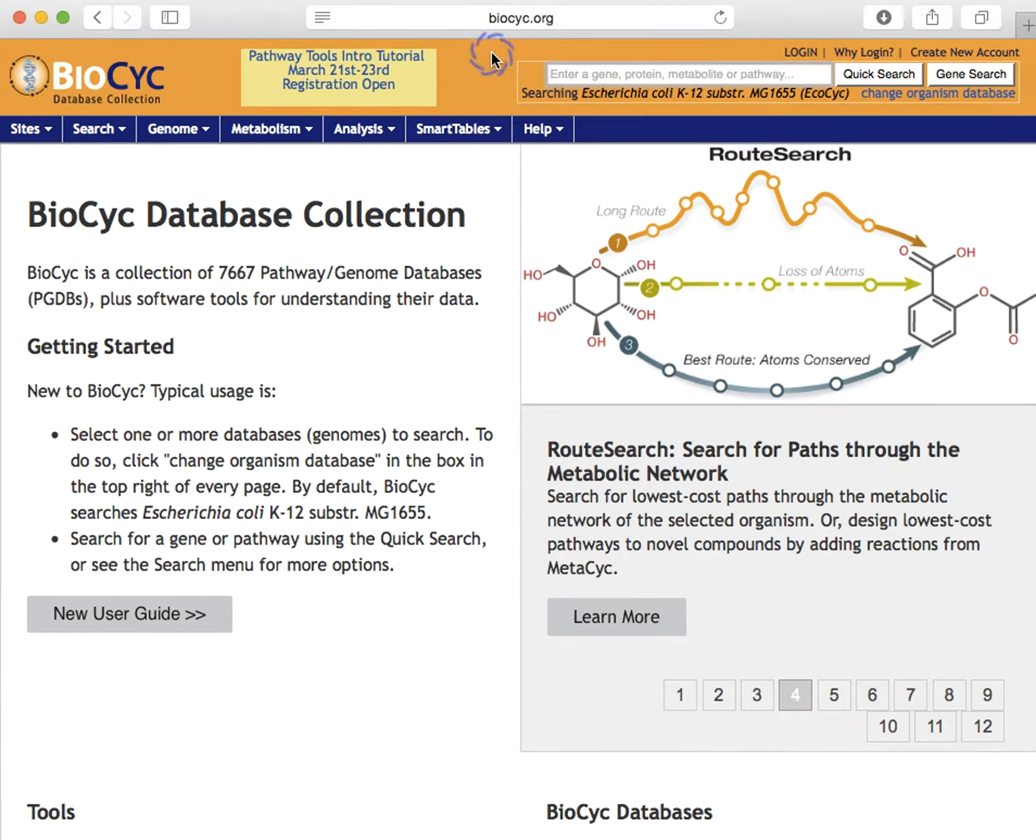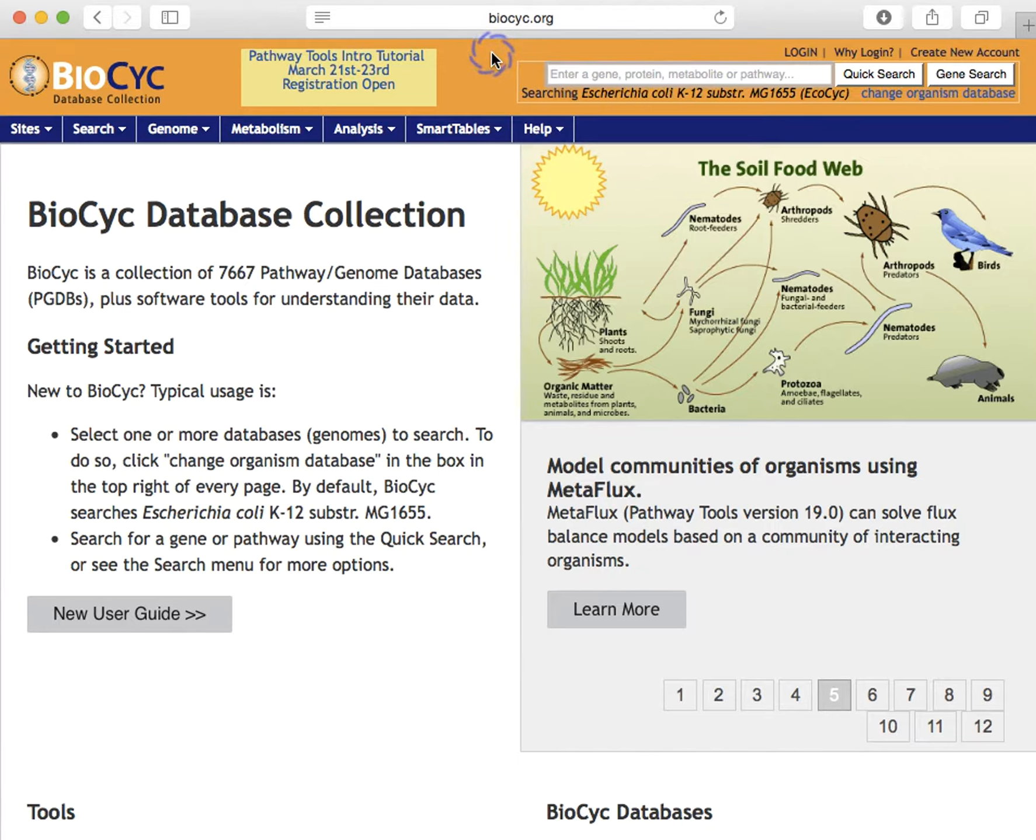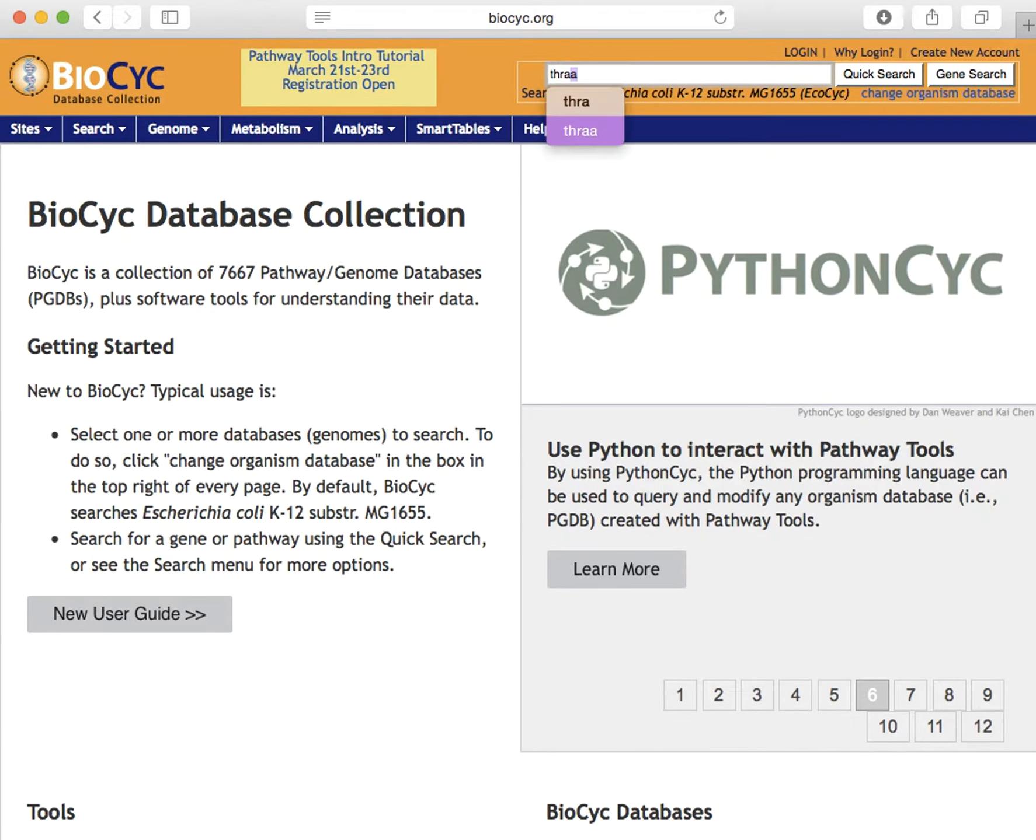Let's begin by searching for the E. coli gene THRA. We could perform a quick search to find it, but it can take time to sort through all the quick search results. So we'll use the gene search button. We just want one A there, which will go directly to the gene page if it finds a single gene with that name.